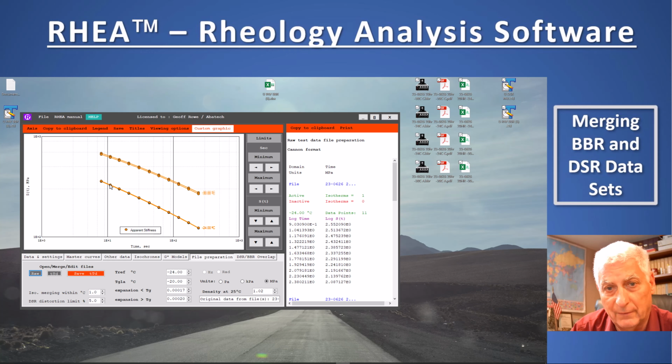These additional data sets mean I am conforming with a rule which is to preferably have greater than five data points per decade of time or frequency. You can see in this decade here, I've got 1, 2, 3, 4, 5, 6, 7 data points to represent the information. The results are reasonably close. You can see that there are 2 replicates here and 2 replicates here.